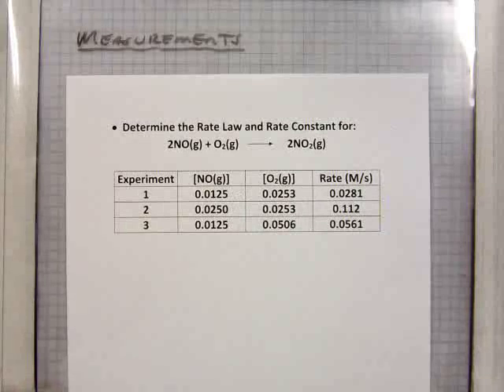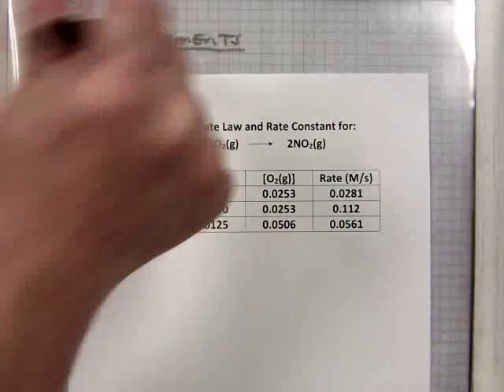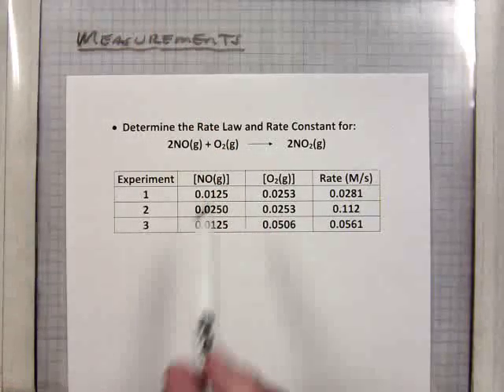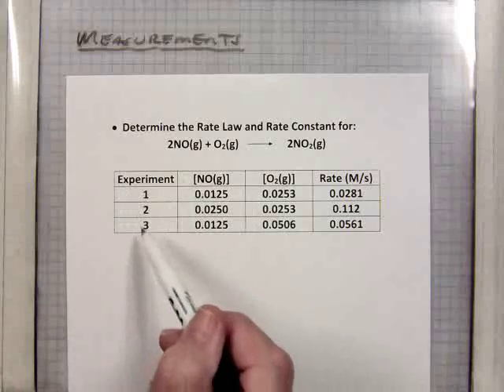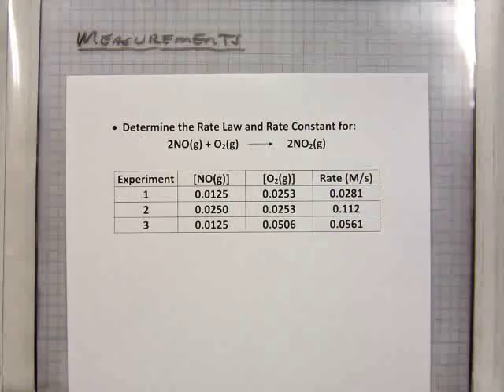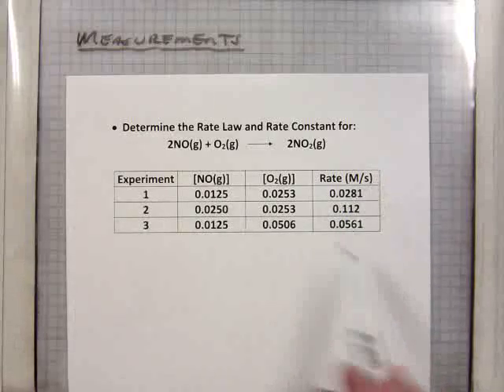Don't get confused on me, because I'm trying to teach you this. This is what you're going to do. You're going to set up one of these, and you're fixing to measure that. How are you going to do that? You need to start out with experiment 1, 2, 3, and you're not going to have 2 components. You're only going to have one, which is the T-butyl halide. And you're going to have concentration 1, concentration 2, and concentration 3, and you're going to look over here and see what happens.